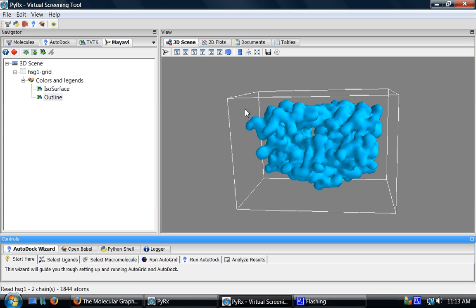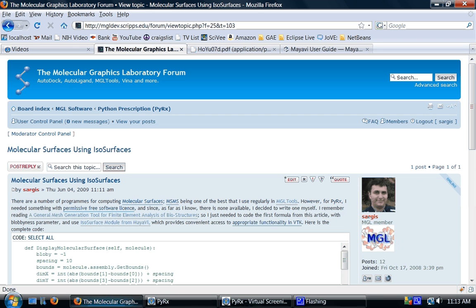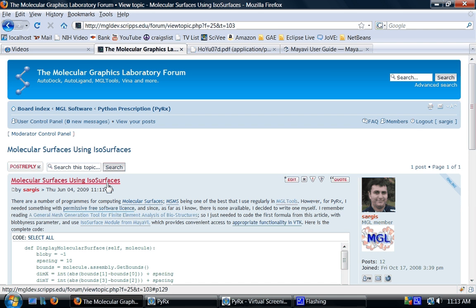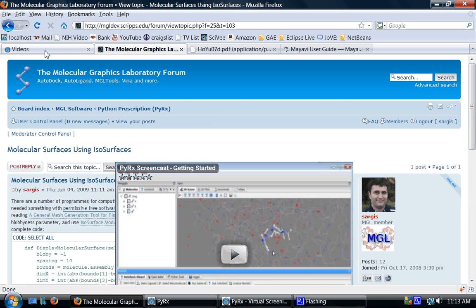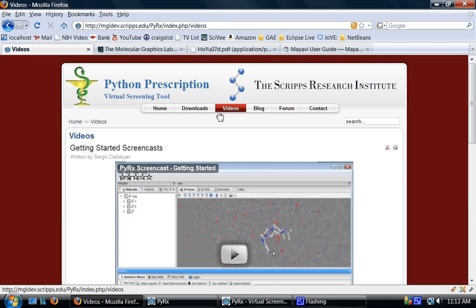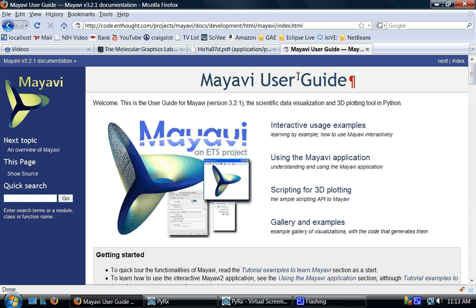I've explained this algorithm in PyRex forum under this topic. I'll post a link to this topic in PyRex website under videos. I'll post a link also to MayAVI user guide where you can learn more about MayAVI.